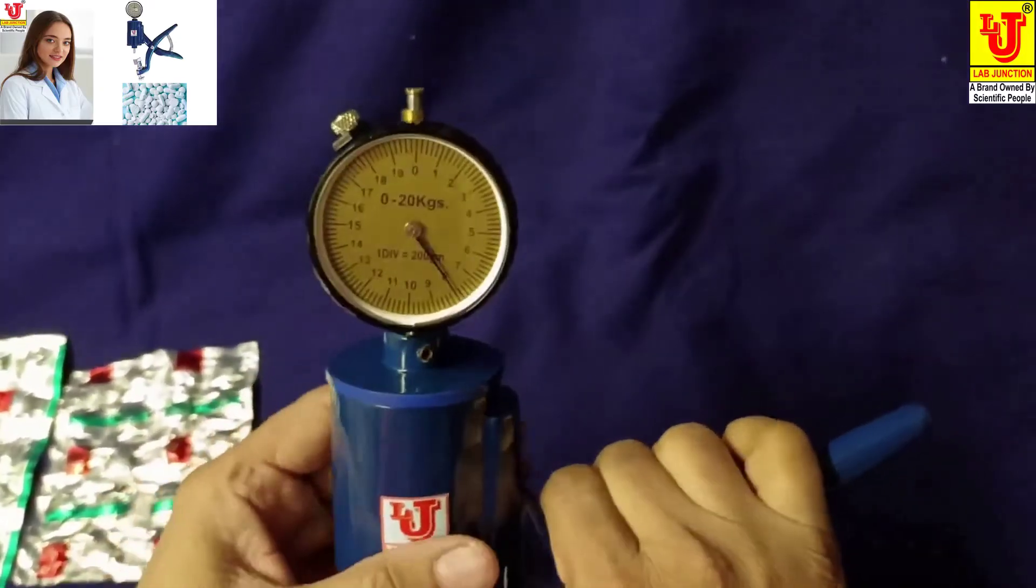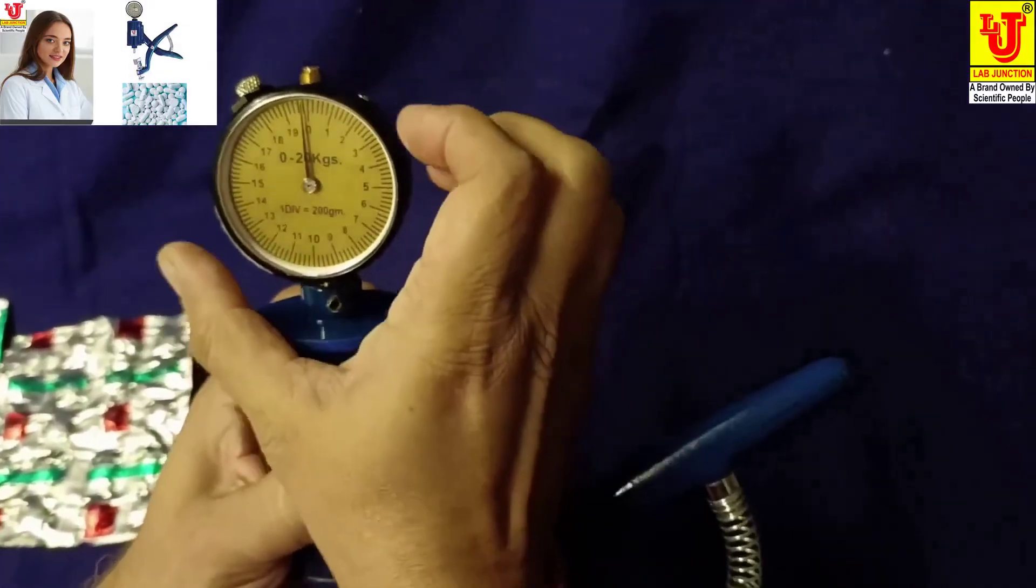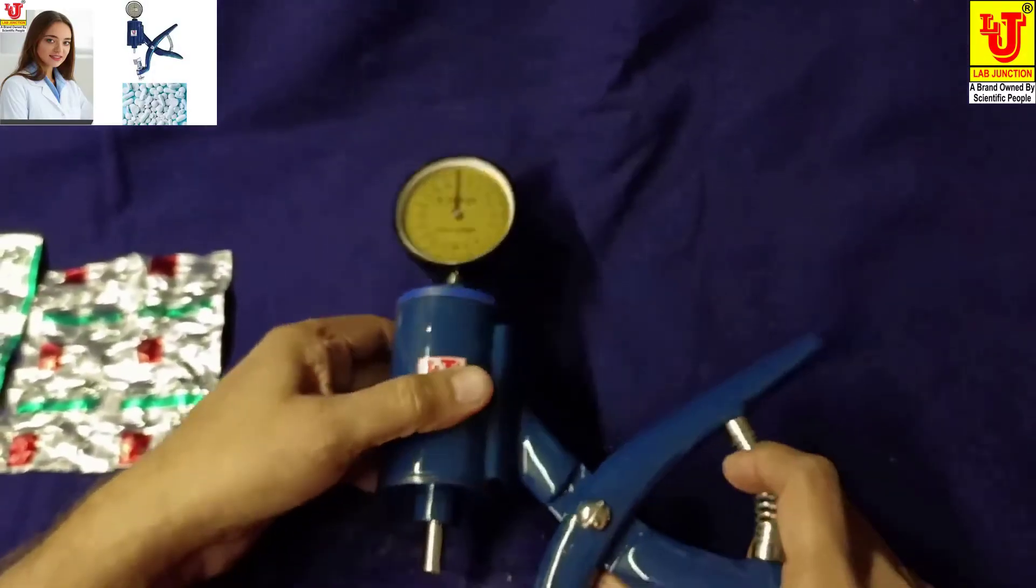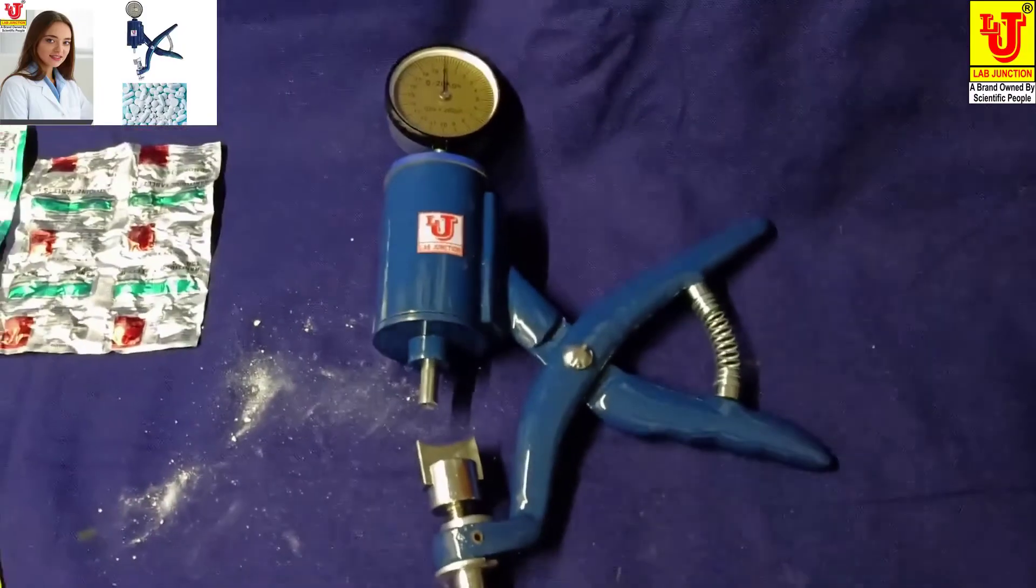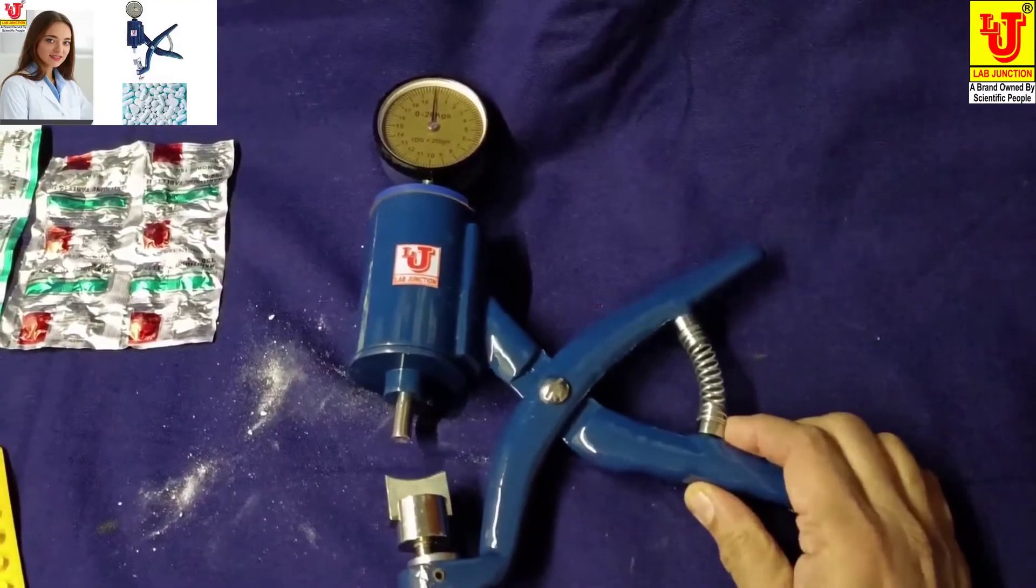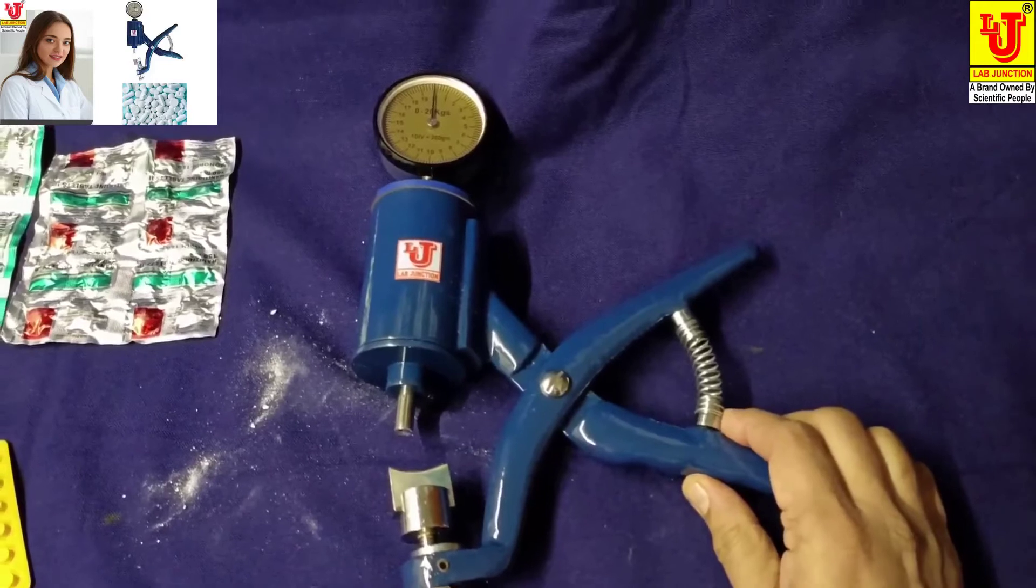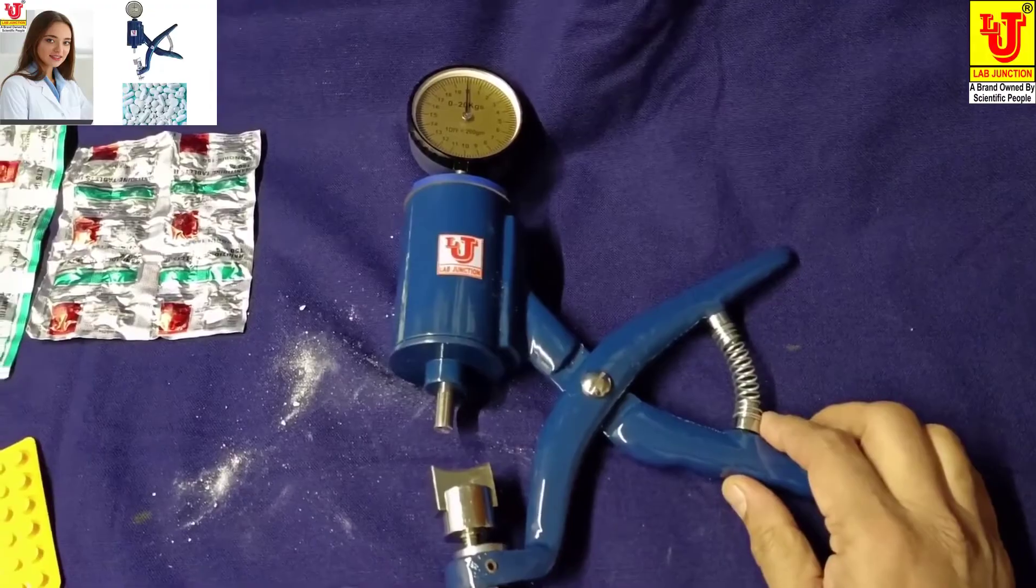This is how you use the P Pfizer type hardness tester. This is the complete demonstration of this instrument. Lab Junction gives one year warranty other than breakage.